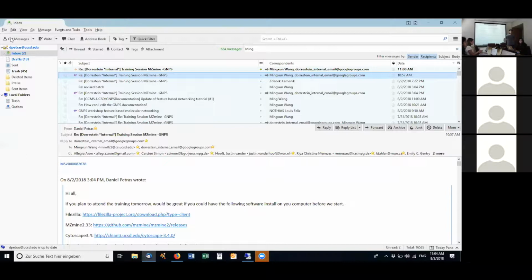Did you get the links? Yeah. Okay, but you didn't have problems? No, I don't think so. Okay, that's weird. So maybe you downloaded it at home also. So it seemed to be a problem. I just had to update my JavaScript.